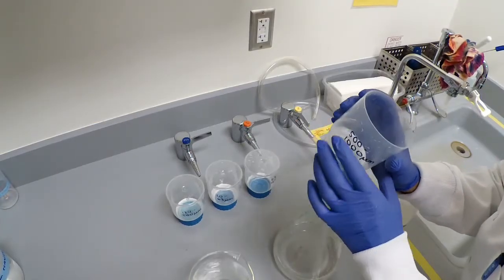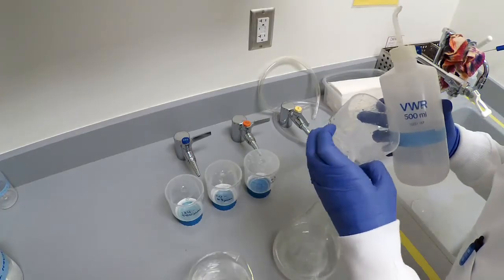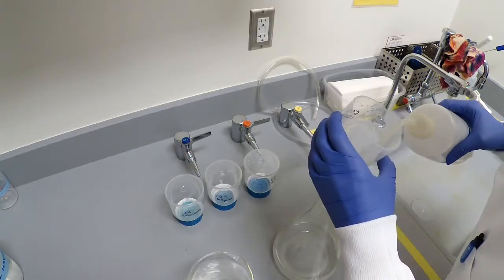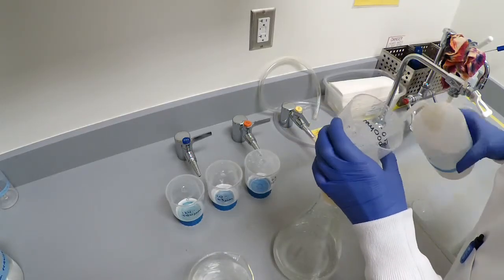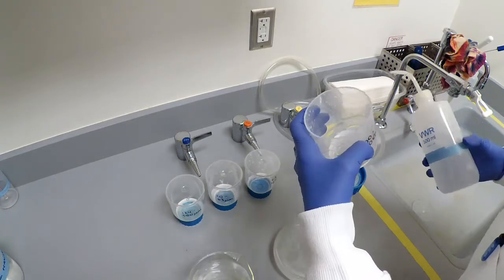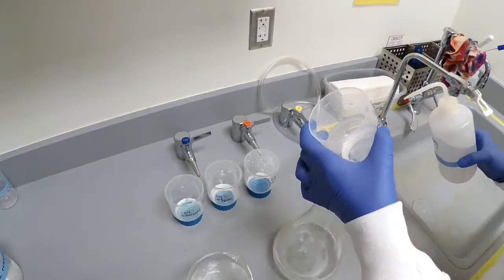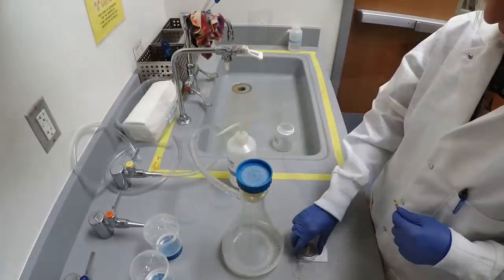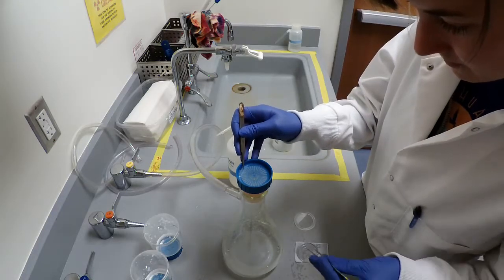Then, take off the top of the filtering unit and rinse off the edges of the filtering unit onto the filter. Remove the filter and place into a petri slide for storage until evaluation with a light microscope.